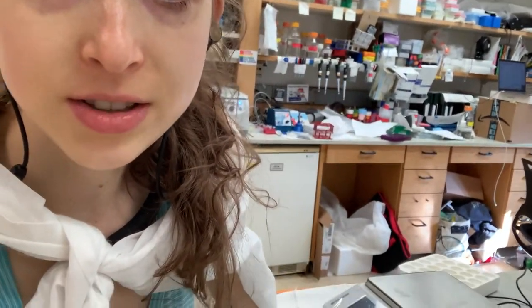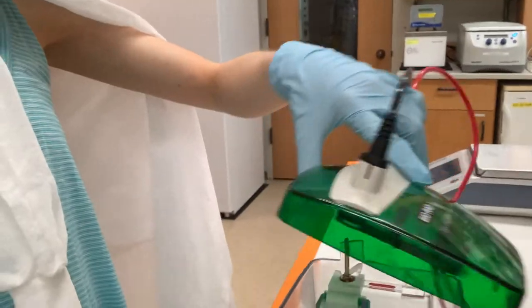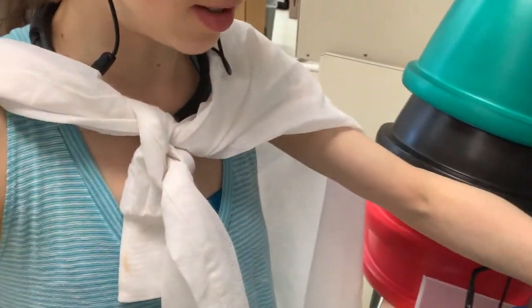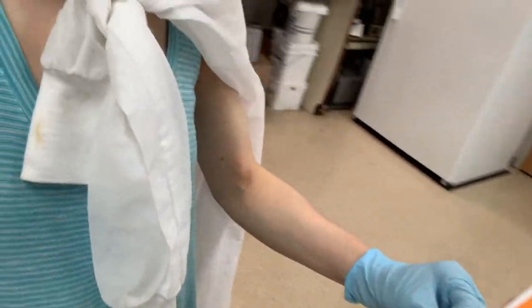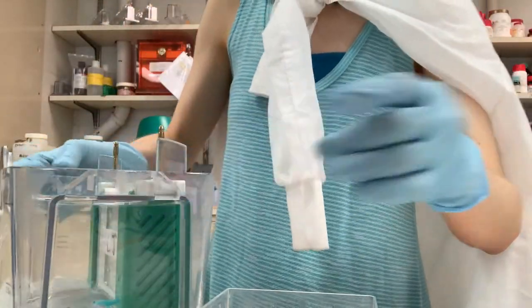Our gel should be done now. You can see the dye line is almost to the bottom. Normally I let it go all the way out, but people are going to be coming into the lab soon, so I'm going to stop it now. I'm going to turn off the power box and take the gel out. First I need to get a gel staining box.